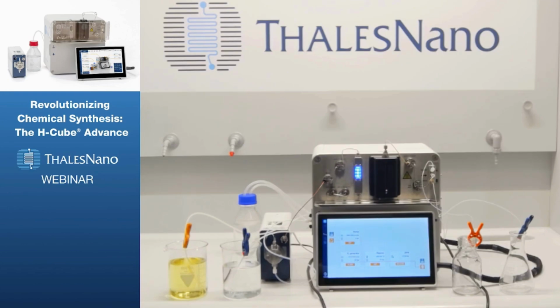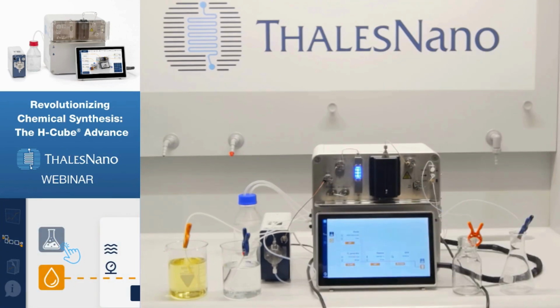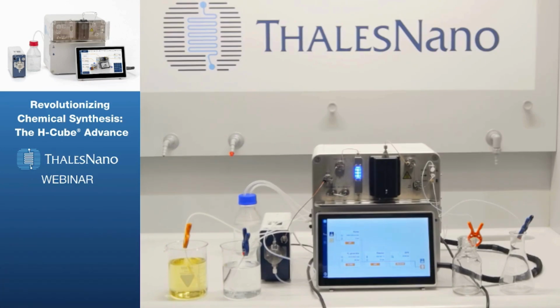So far, for 10 minutes, I was injecting clean solvent and the hydrogen mixture through the catalyst cartridge to activate its active sites, at 100 degrees and 50 bars of pressure. Now we are ready to start the real chemistry, which is very simple. It just takes 2 buttons, because I'm now going to switch from the solvent to the actual starting material injection. And maybe after 2 or 3 minutes, we can also switch the waste collection to the product.